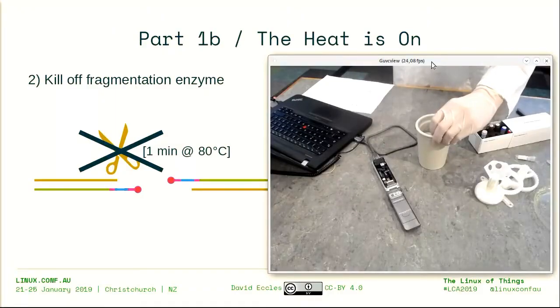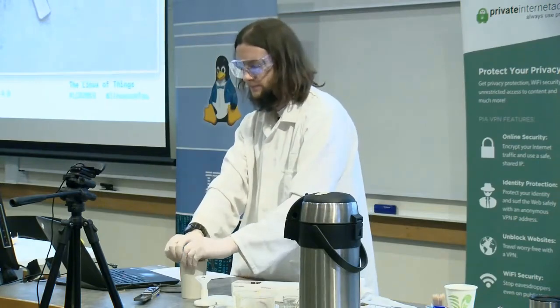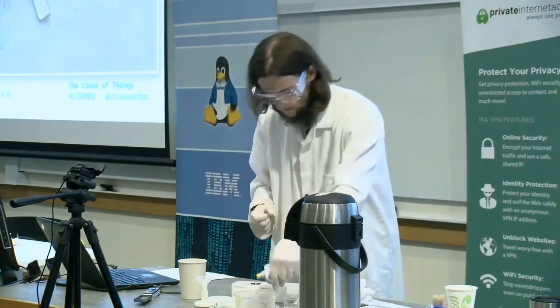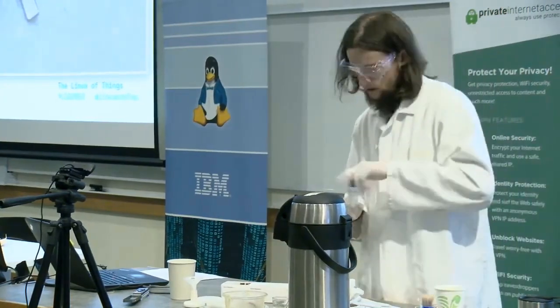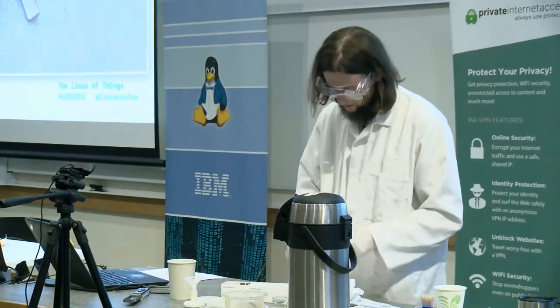Once these are inactivated, I'm able to pull these two samples together. Now that the samples are barcoded, they can be combined, and then I should be able to separate them later. Okay. I'll take 5 microliters of each and put them in a new tube.